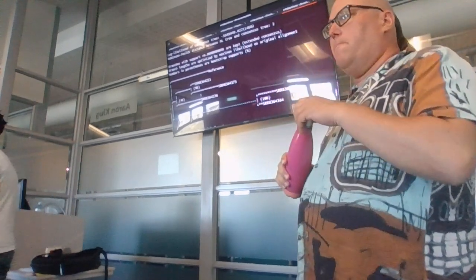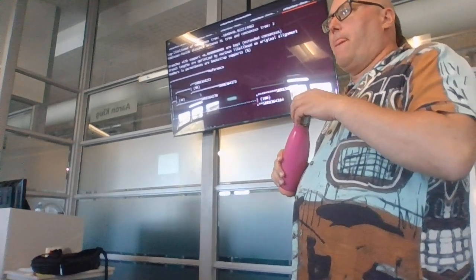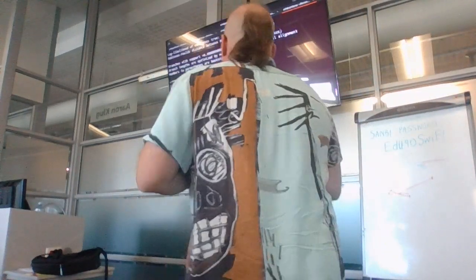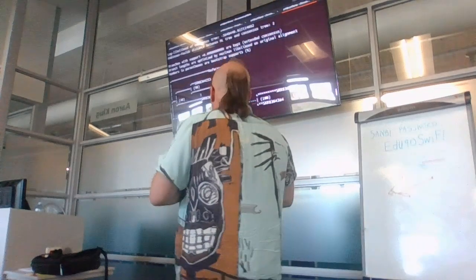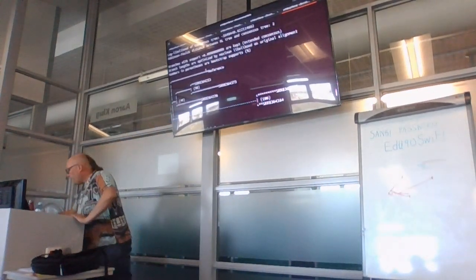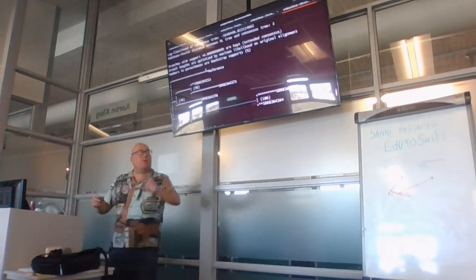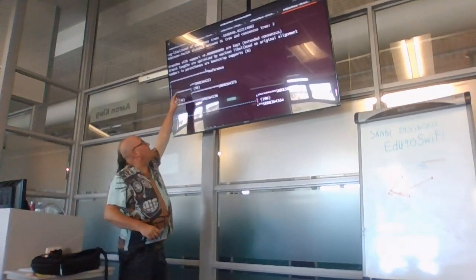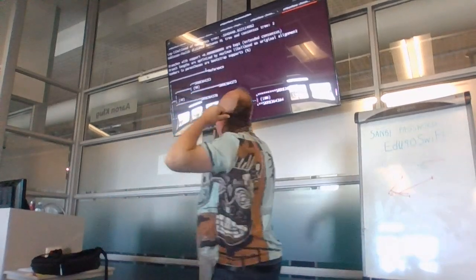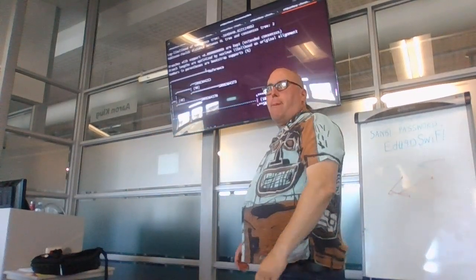So the relatedness now comes to those ones up or to the reference? It's based on the reference. What we've got here is that the reference is clearly in its own clade. It's only been used to guide the tree. The reference might be here. Someone is asking what 40% actually represents.